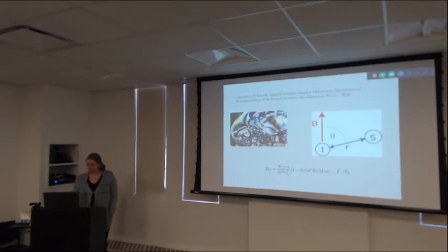We talked about applications with partially aligned solution samples. So if a solution sample is not completely spherically averaged, it will have part of these couplings, CSA or dipolar, remaining. We talked about that a little bit.